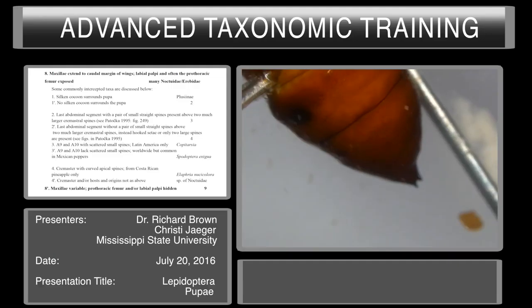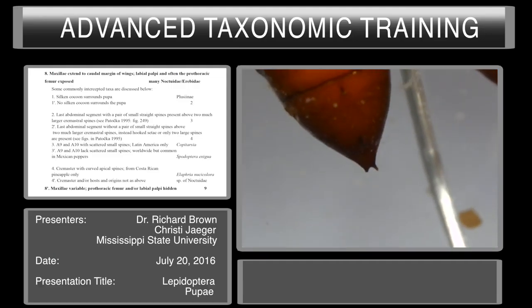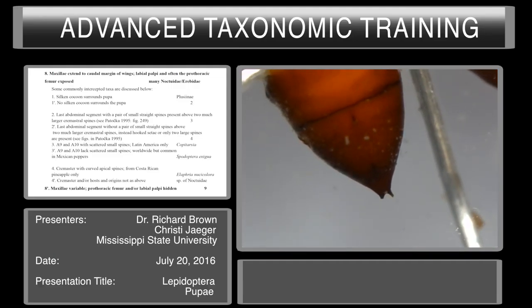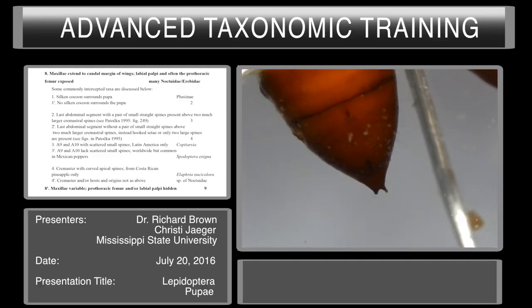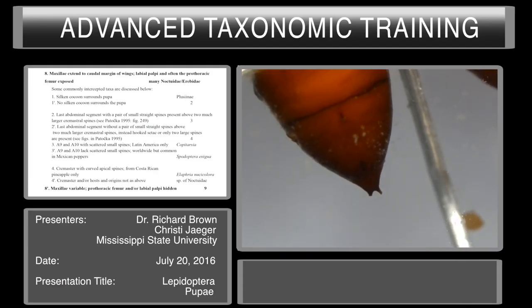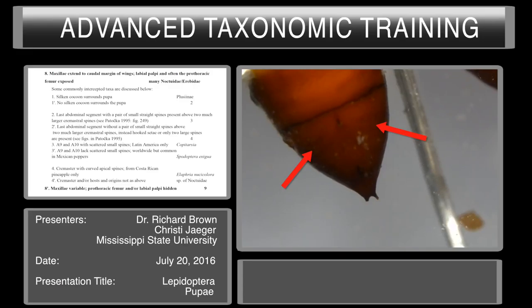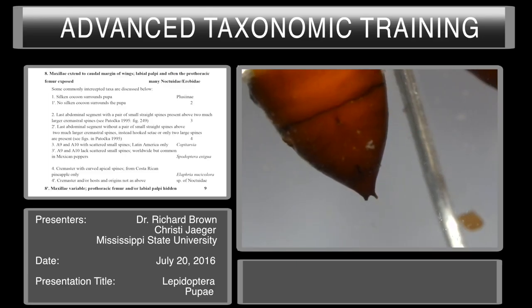If we look at this female pupae right here, we can also see an anal slit and a gonopore, and we can also see the eighth and ninth intersegmental membrane. But it is now in a V-shape and it leads up to the gonopore.